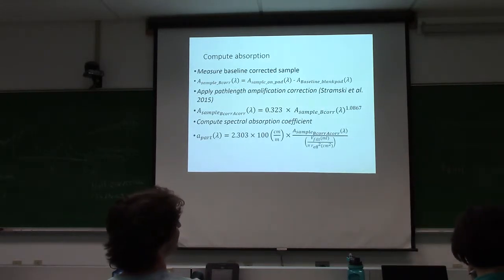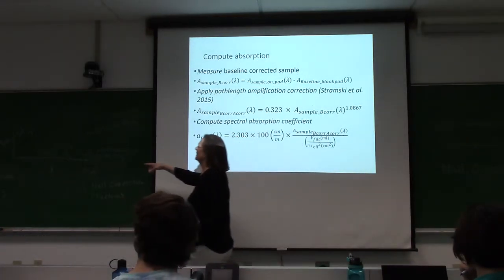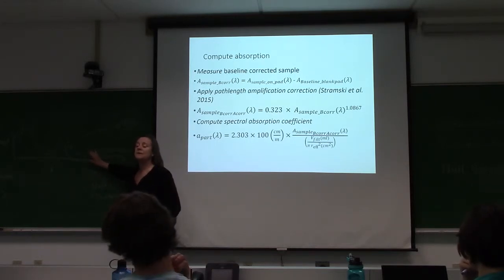But I will tell you that after doing a bunch of these types of measurements, I don't subtract because I would rather just say that that's my uncertainty because of the filter pads. Use that as your error bar? Yeah. Or just, I cannot resolve my absorption within this much.